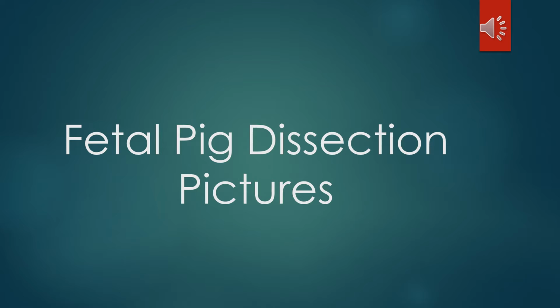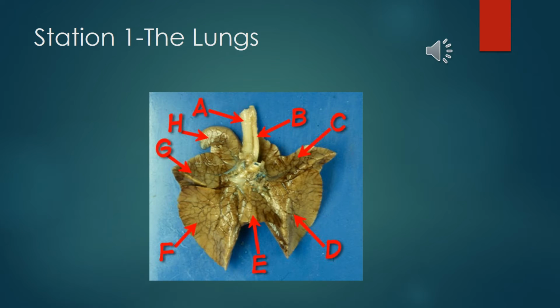Now, one of the things that you should realize is that there's a few of them that are not in order. So, like the lungs, for instance, you won't get that until after you take out the lungs. But by taking out the lungs, you might not be able to see the other parts that you may need. So be really careful and go through this whole presentation before you share it with everybody else. Okay? So, here we go.